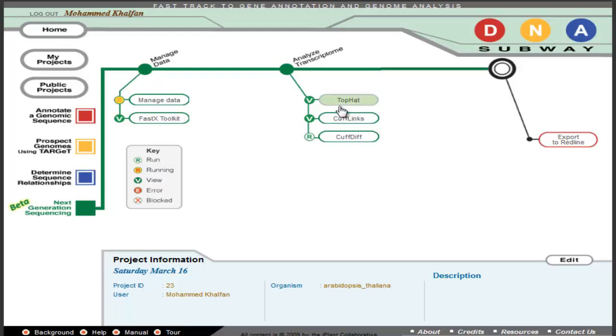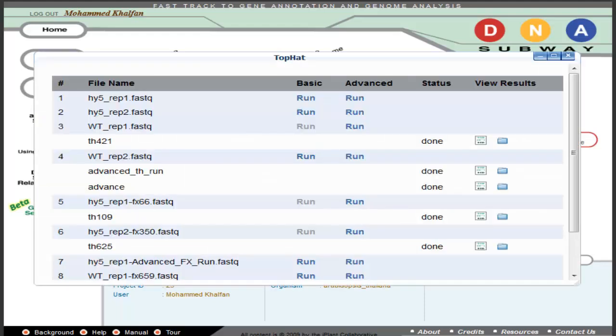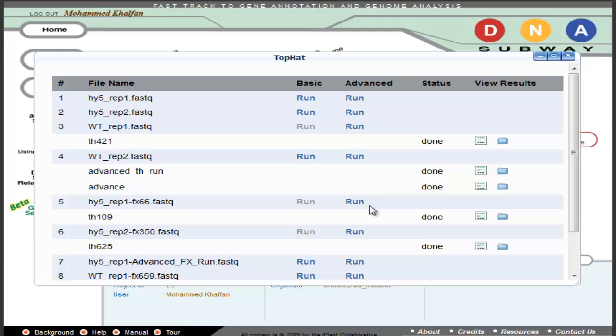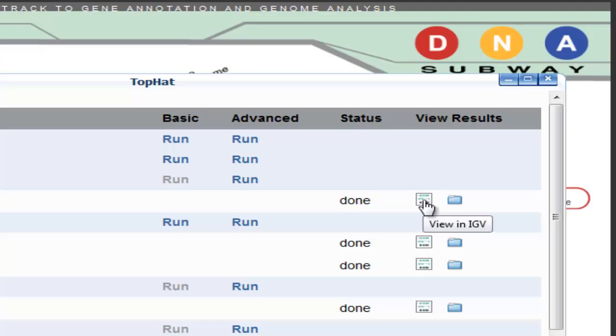At these various stops, as shown previously, you'll be able to run using either basic defaults or customized advanced parameters. Then, you can either download your results, or in some cases, view the reads using IGV Viewer.